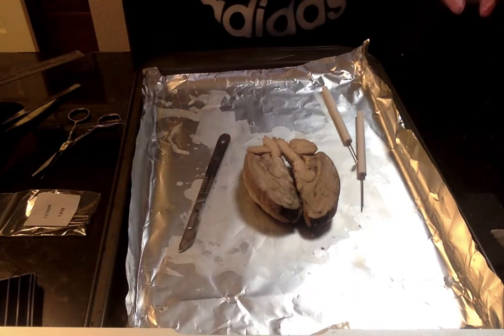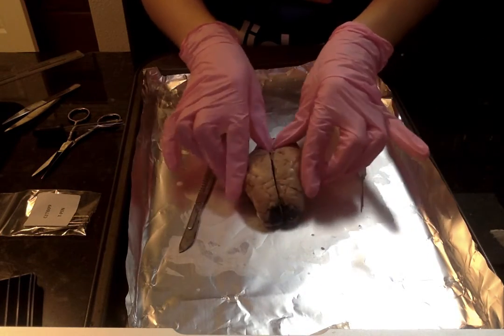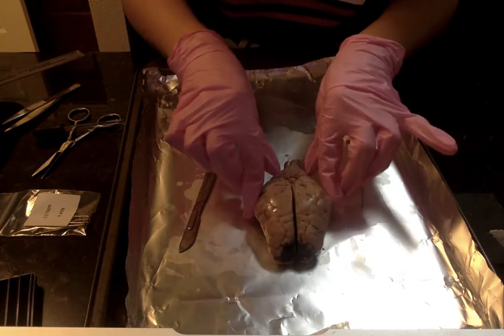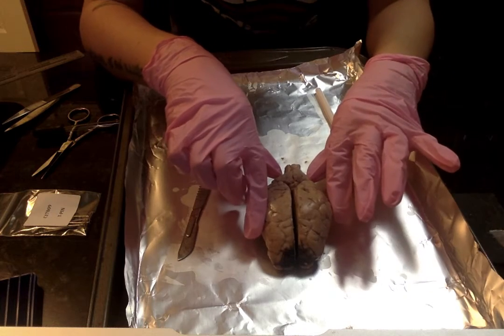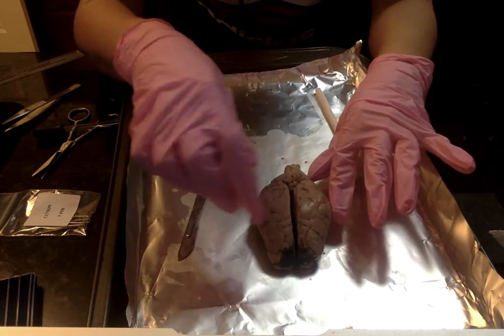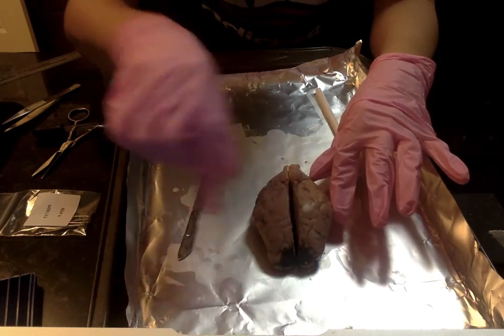So I think now I want to return to the dorsal view of the brain if possible, and I want to be able to identify the frontal lobe, which is going to be right in this area.